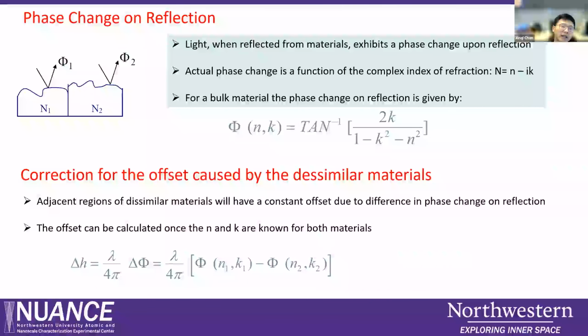They coat a dissimilar material, using an optical profilometer.